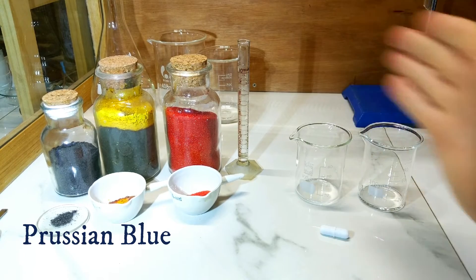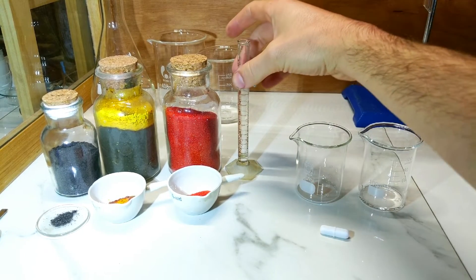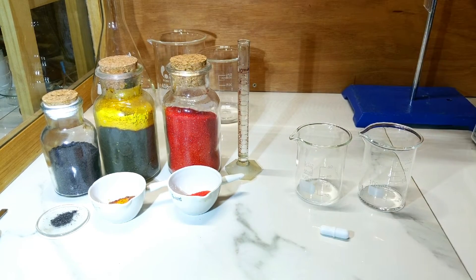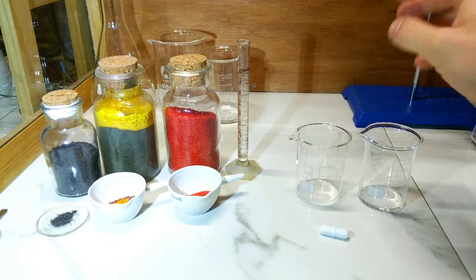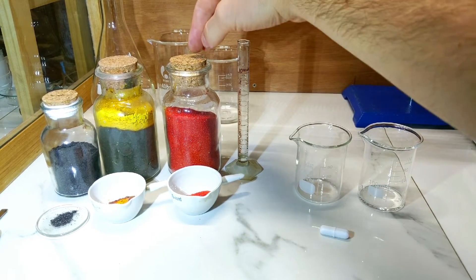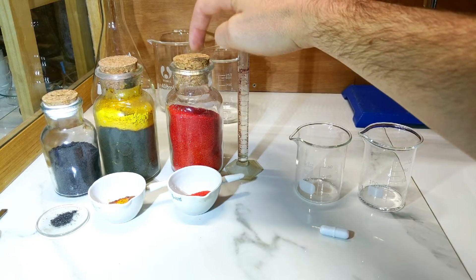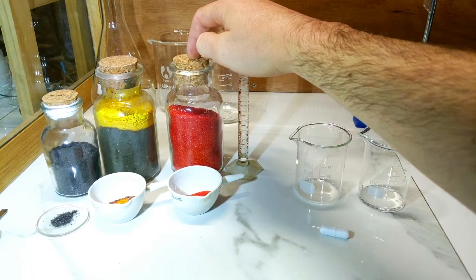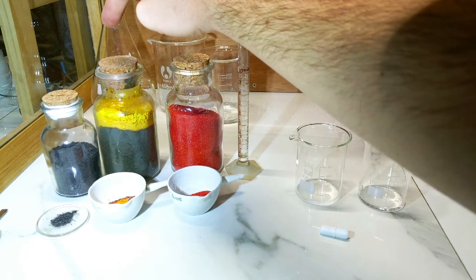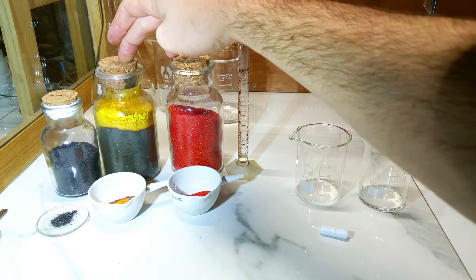These are the beginning chemicals for today's process, known as the direct method for making Prussian blue. This involves making up a diluted solution of potassium ferricyanide and co-precipitating that with a ferric chloride solution.